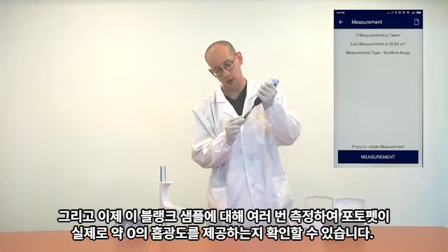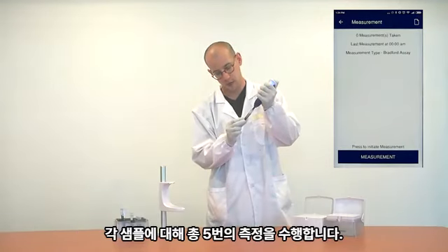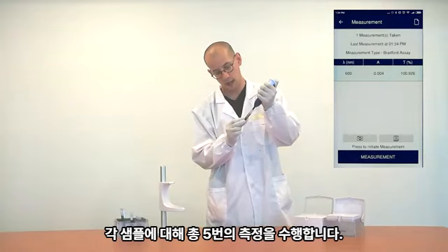And we now can also take multiple measurements on this blank sample to make sure that PhotoPad really is giving absorbances around 0. For each of the samples, I will take a total of 5 measurements.